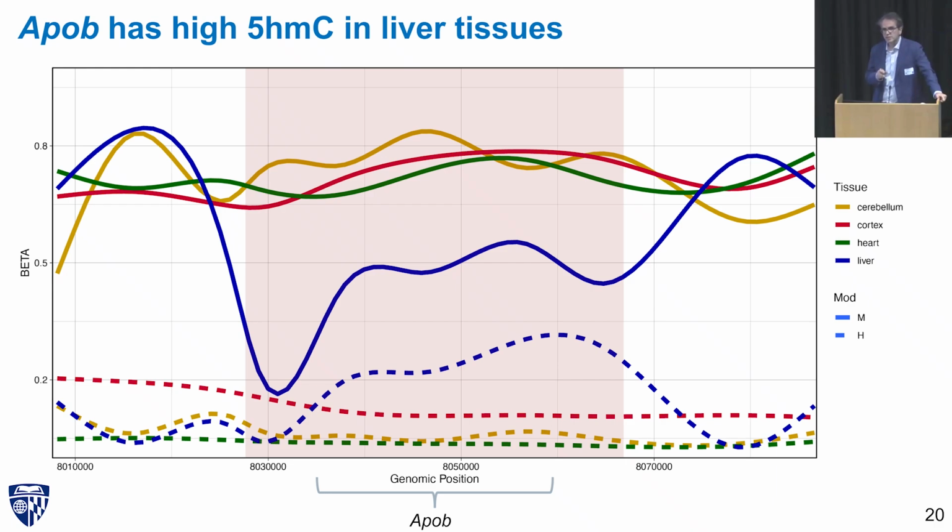It could be that this could tell us more about how epigenetic regulation is actually being modulated in tissues and in reality that we cannot observe, because the cells are dividing too fast and the HMC marks get wiped away because they're too transient. But in cells in actual tissue, the mitotic clock speed is often slower.